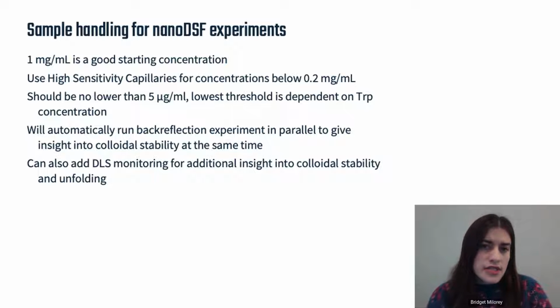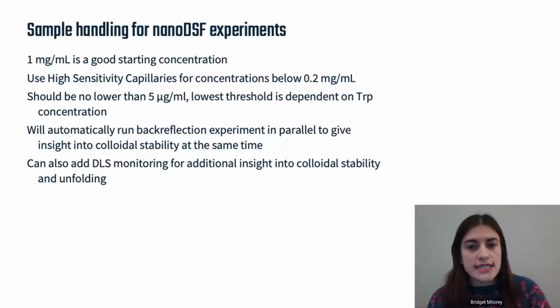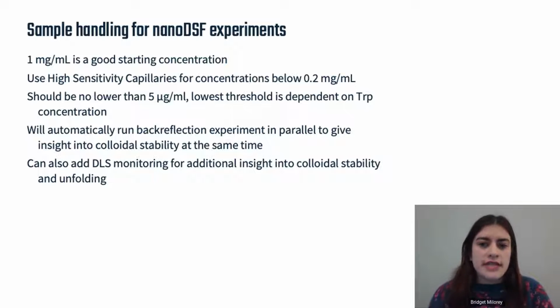We do our experiments in capillaries. So it's always important to consider handling the capillaries properly. You do not want to touch the capillary in an area where the optics are actually reading a measurement. And also, for nanoDSF being an intrinsic technique, you want your sample to be about 80% pure minimum.